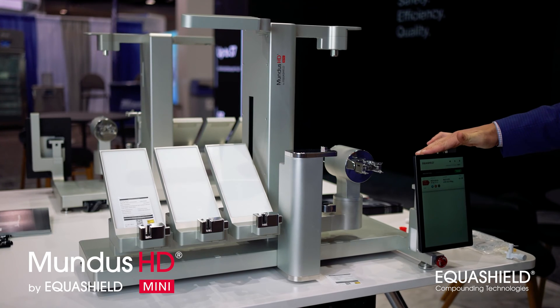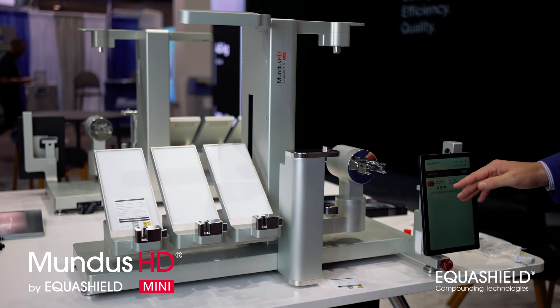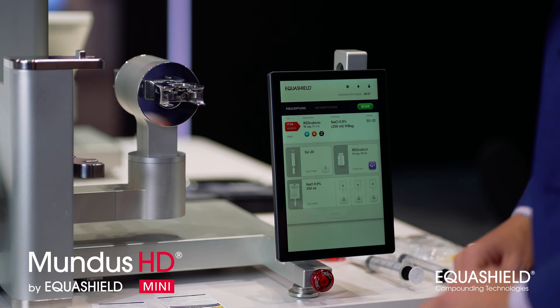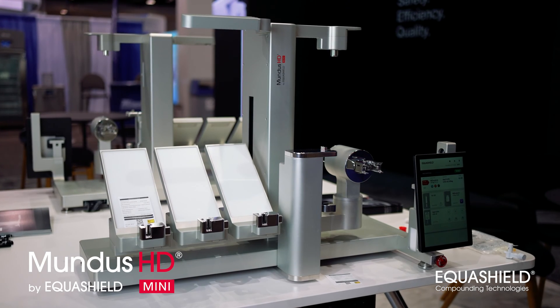I'm going to start with the Equishield Mundus Mini HD screen. This is the instructions that are going to tell me what to do to compound the drug. I'm going to swipe this to the right. Now it's telling me what I need to load into the proper channels to begin the compounding process.